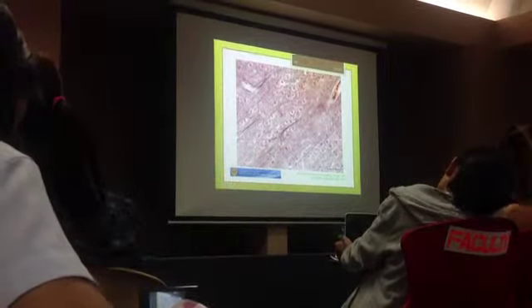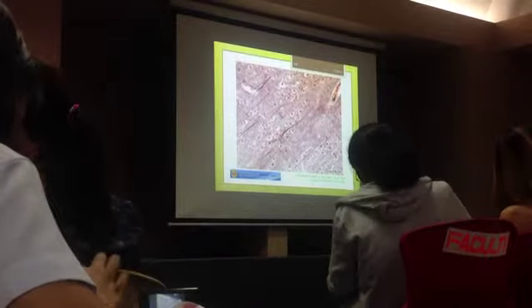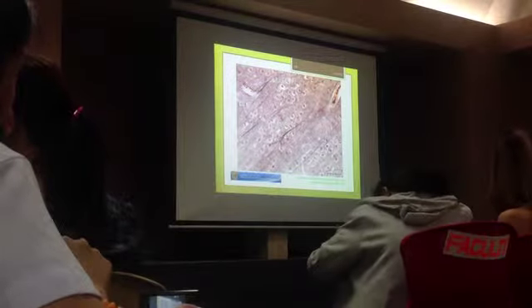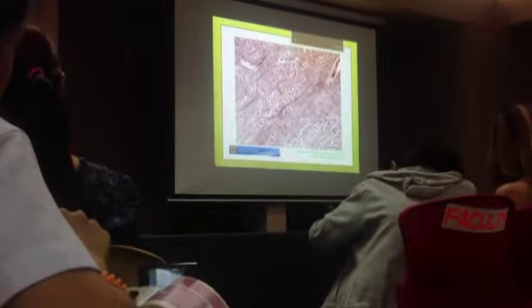According to function, motor. I told you earlier, the multipolar cell is the only cell that we can clearly identify under the light microscope.